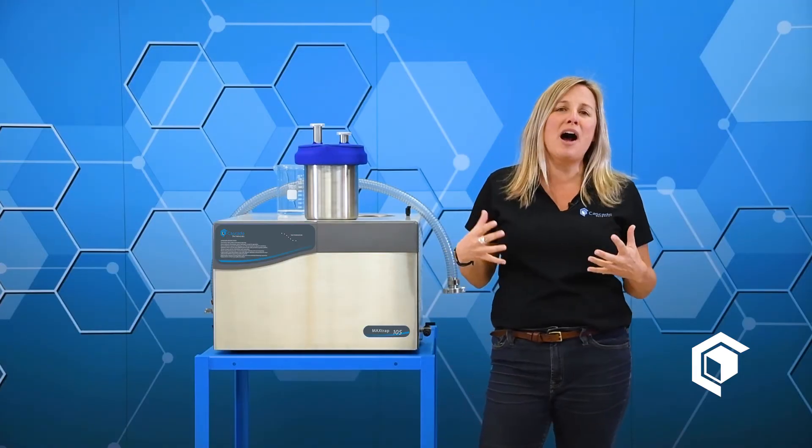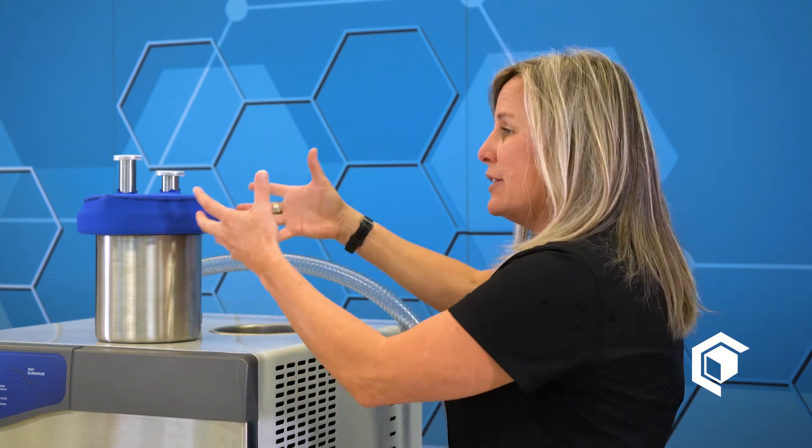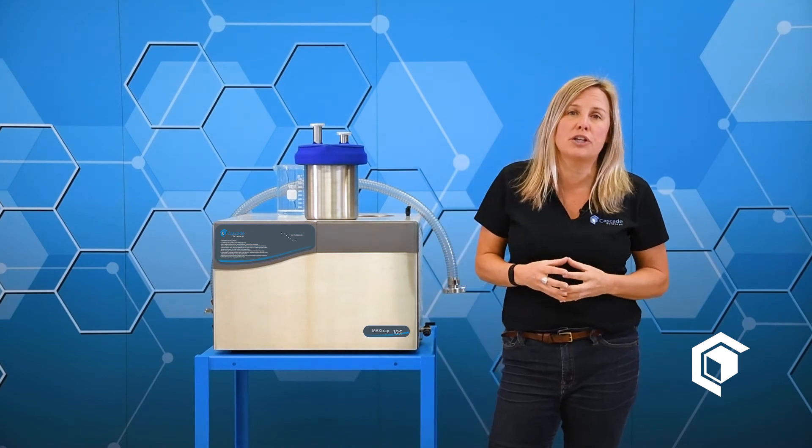Another tip: when you turn the cold traps on, they're not going to be instantly cold. They're going to take somewhere between 20 to 40 minutes to reach their ultimate temperature. Also, if you are outgassing something that does not get along with stainless steel, let us know — because we have glass trap inserts as well, and glass will probably tolerate your acidic or corrosive application much better.